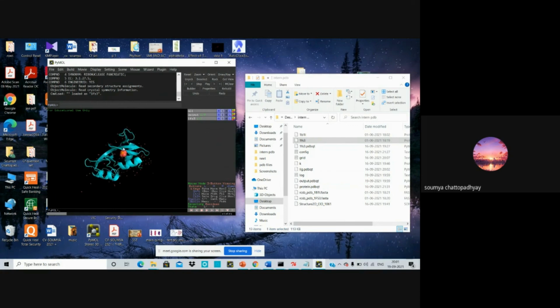So whatever the total things we did in docking, we did the preparations of the protein and the ligand. Yeah, like trial and error with this ligand. Exactly. You have to study about the protein. What are the expected ligands you can have so that it attaches? I studied about RNA ribonuclease, so it said that it can attach phosphate based ligands.